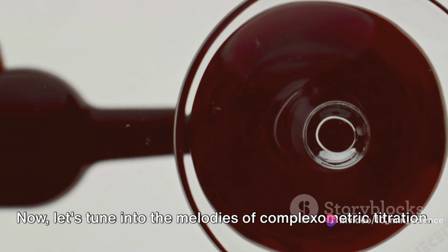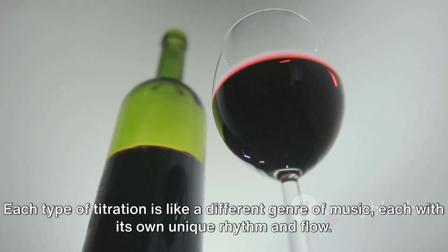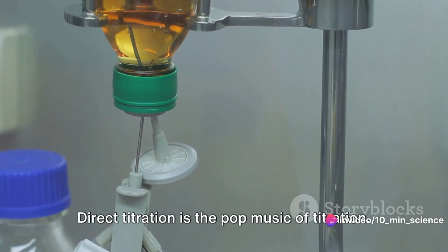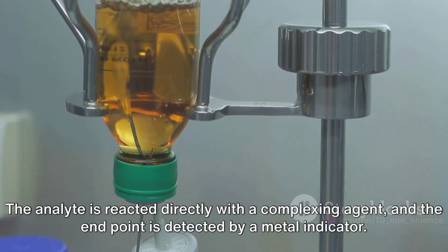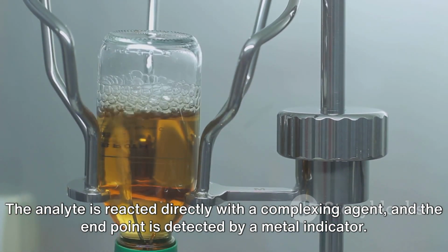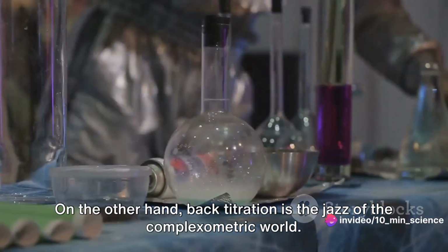Now, let's tune into the melodies of complexometric titration. Each type of titration is like a different genre of music, each with its own unique rhythm and flow. Direct titration is the pop music of titration. It's straightforward and simple. The analyte is reacted directly with a complexing agent, and the end point is detected by a metal indicator.